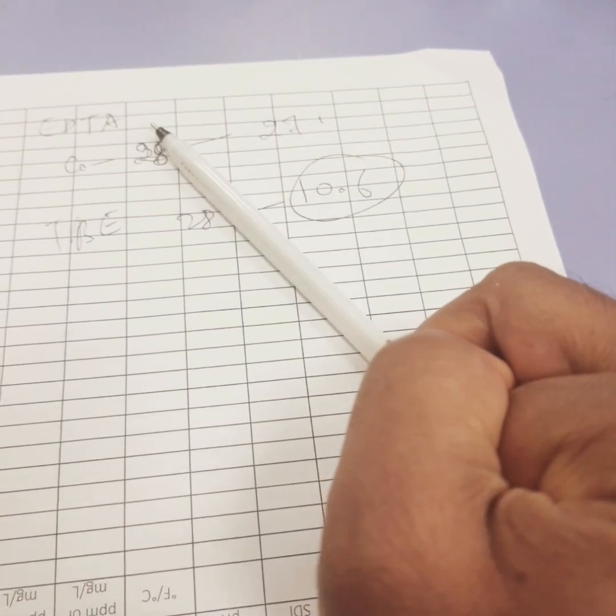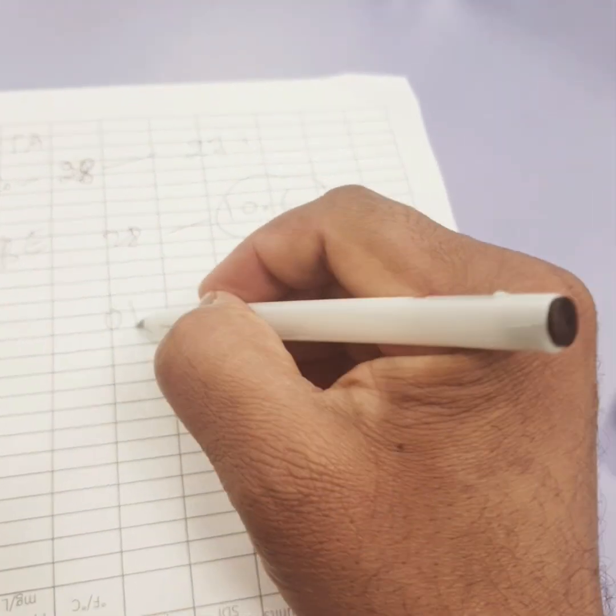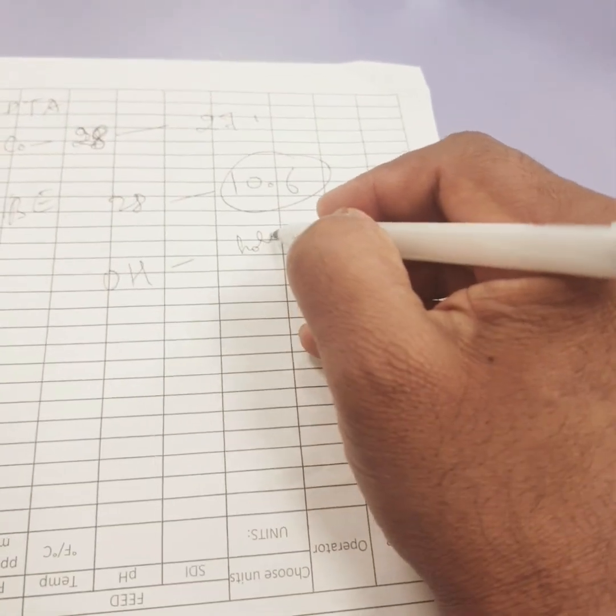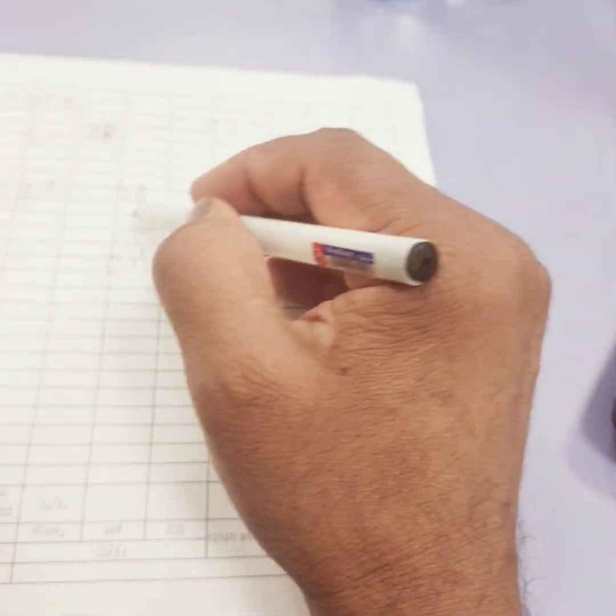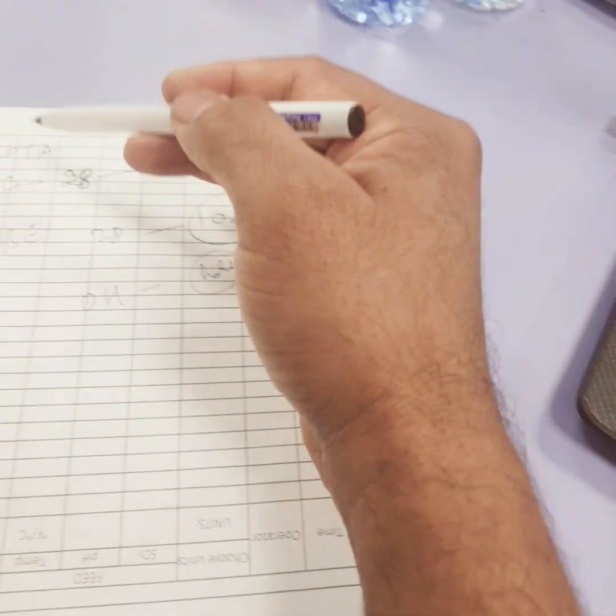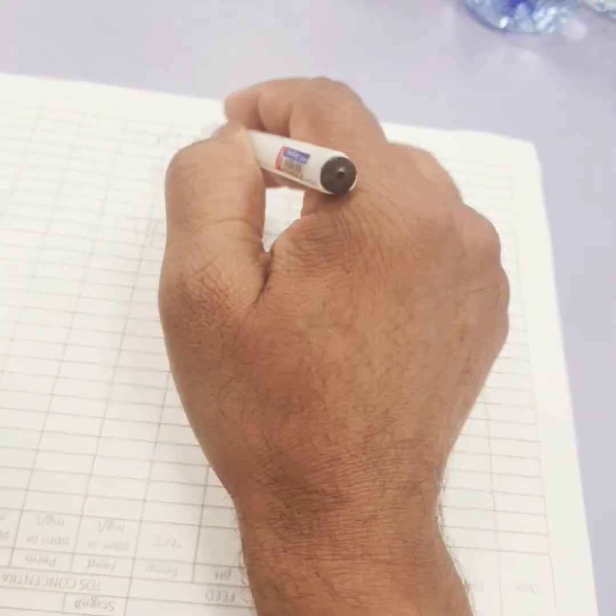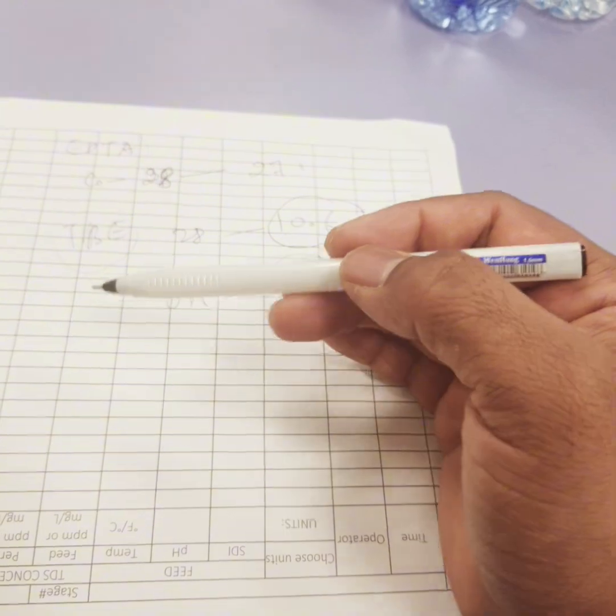So this is my dominant one and this is my least dominant one. In this way with the role of these scavenging solution or elements we can find out which is more dominant or which is least dominant.